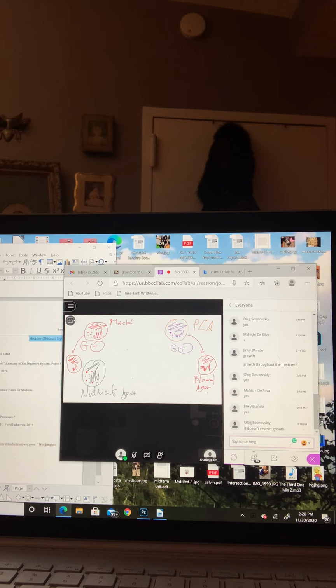So you have to study, of course, or describe the morphological characteristics, whether they are cocci or bacilli. You can redo the gram staining. If you got a good gram staining from the beginning, then it's okay, you don't have to do it again. That's what happens in our lab. Yes please, any question?